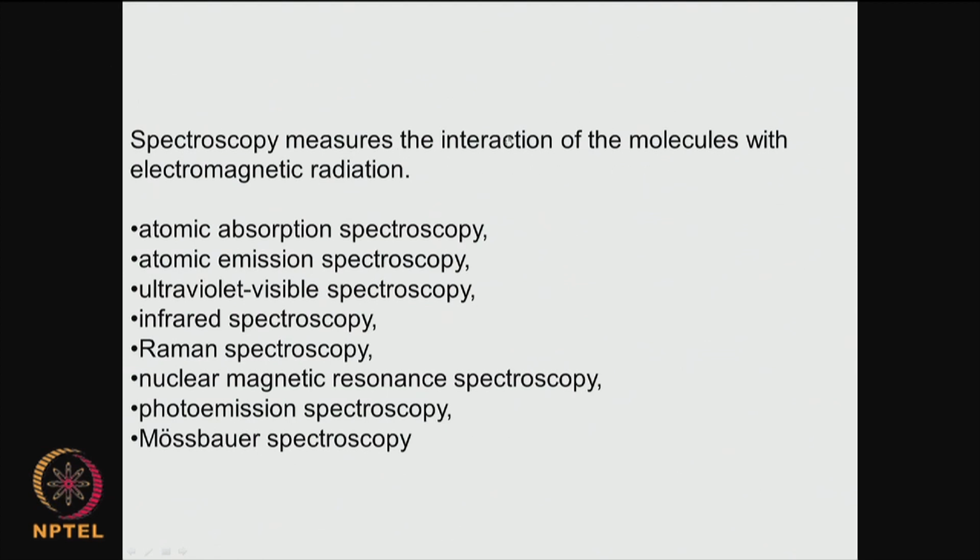So, spectroscopy measures the interaction of the molecules with the electromagnetic radiation. The spectroscopies could be atomic absorption spectroscopy, atomic emission spectroscopy, ultraviolet visible, that is UV visible spectroscopy, infrared spectroscopy, Raman spectroscopy, nuclear magnetic resonance or NMR, then photo emission spectroscopy, Mössbauer spectroscopy.